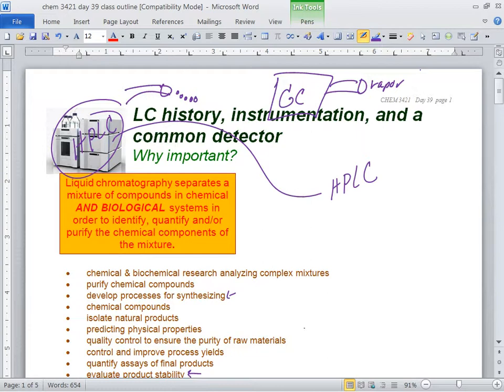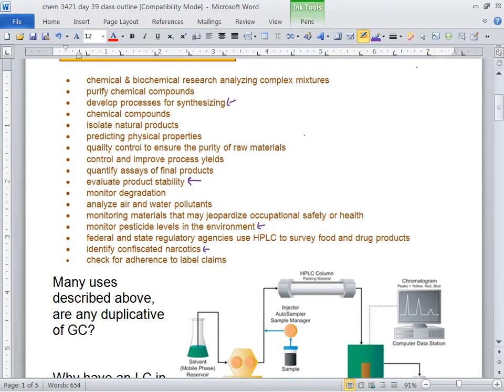So that was the idea of the research, is just to purify these things. And essentially, we had to use the HPLC, right? You grind up the scorpion dust. It's a story how this lady did it, but anyway, we got it done, and then we extracted it, put it on the HPLC, and had little test tubes at the end, and collected all the different fractions, and put each one in a fluorimeter to see which one actually glowed in the dark, or shine a little UV light on each little test tube, each little collection. So that's the power of HPLC. You couldn't do that on the GC. So that's what I see, is something that you couldn't do. Okay.